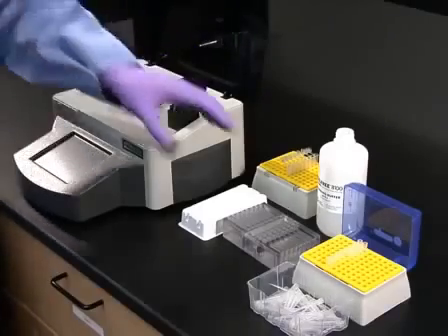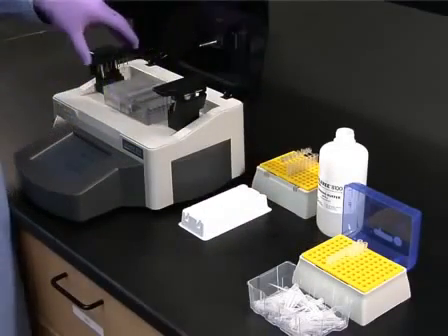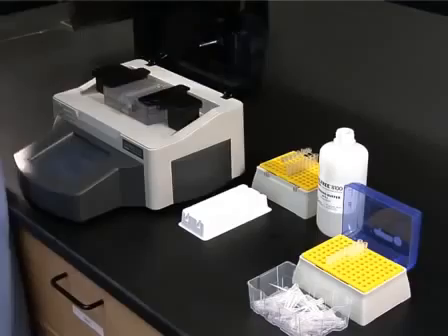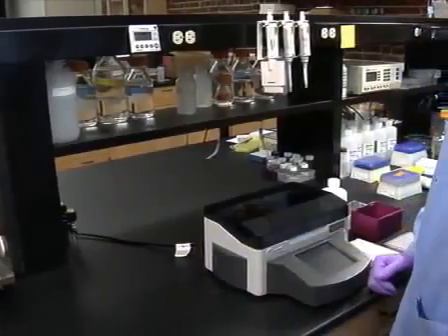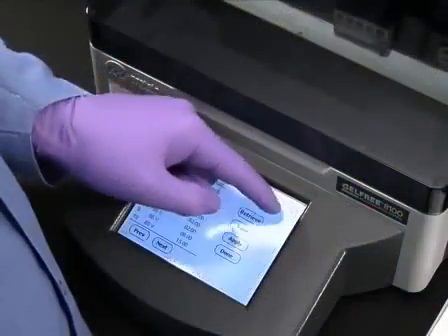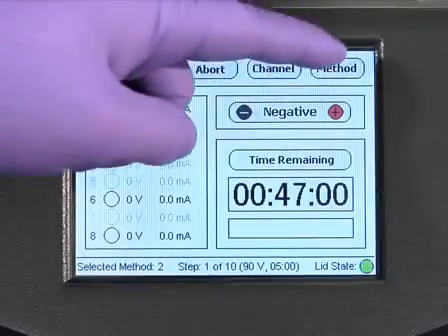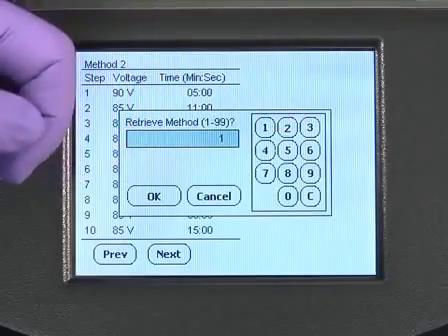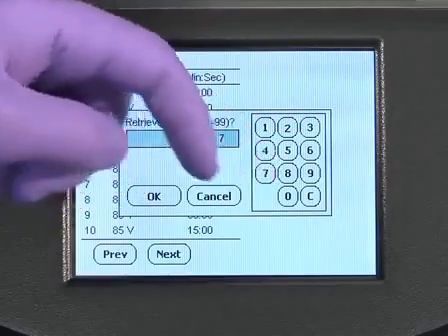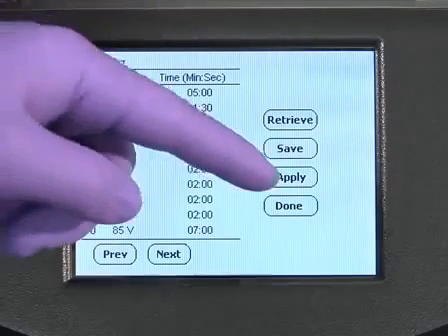Once the samples have been loaded, place the cartridge into the gel-free 8100 fractionation station. Then lower the electrode arrays and close the lid. Using the easy-to-program graphical user interface on the instrument's touch screen display, go to the list of available pre-programmed methods. Select the appropriate method by pressing the method button. Press the retrieve button and enter the number of the desired pre-programmed method using the on-screen keypad. Press OK, then press the apply button.